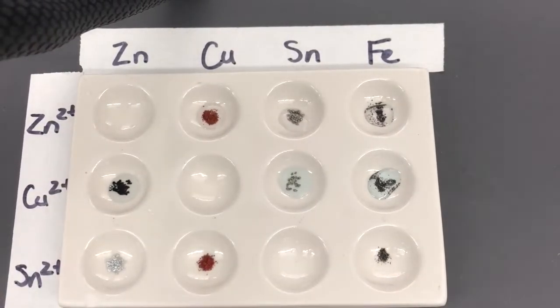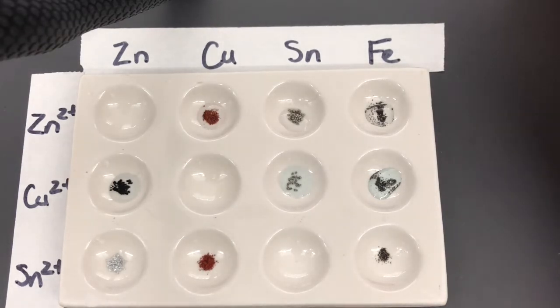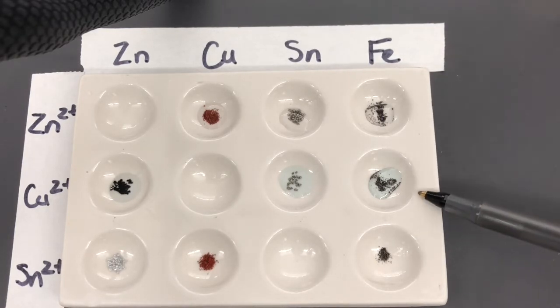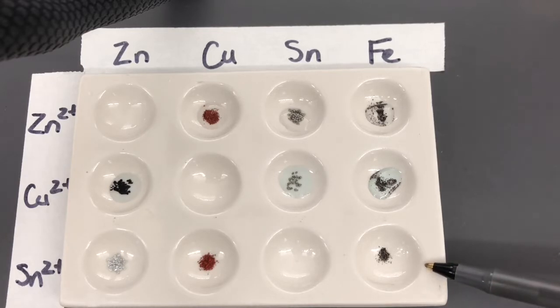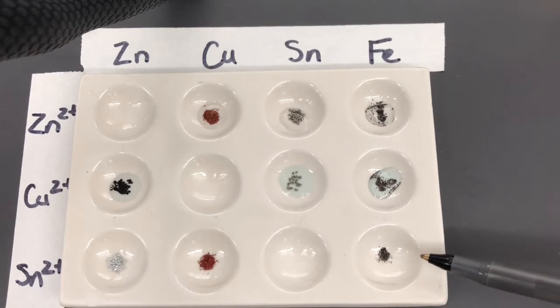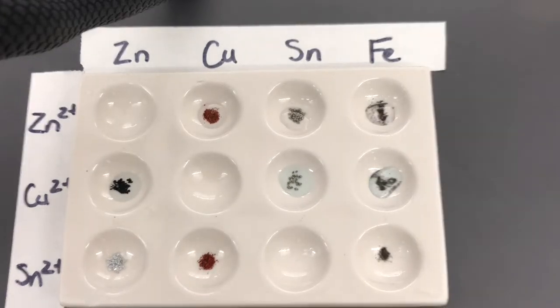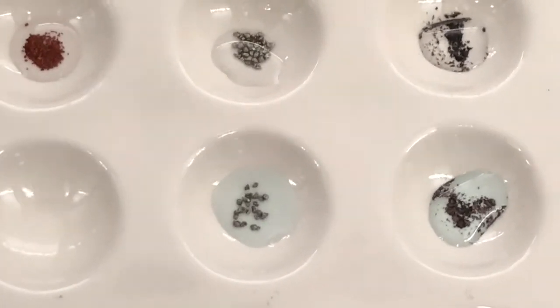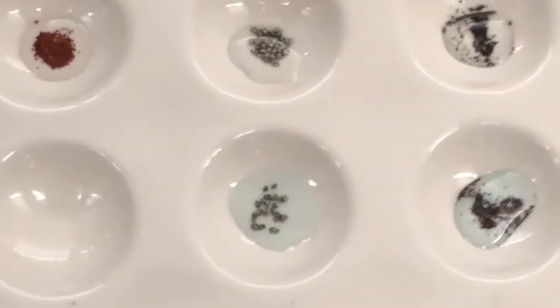Okay, so we've done the first 2 rows. You should make sure you've recorded your observations in your table for what happened when zinc 2 plus was added to the different metals or when copper 2 plus was added to the metals. Now we're going to move forward and look to see what happens when we add tin 2 plus to the different metals. However, before I continue, I want to zoom in a little bit more one more time on the iron so that you see what's happening here.